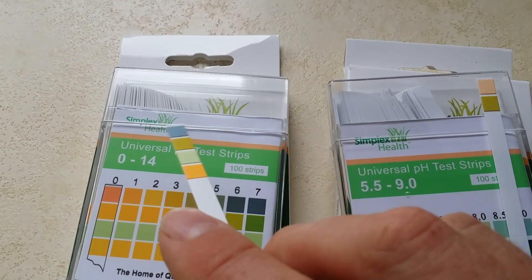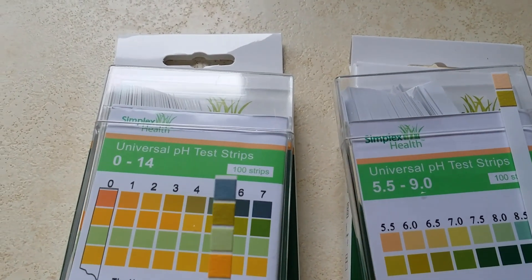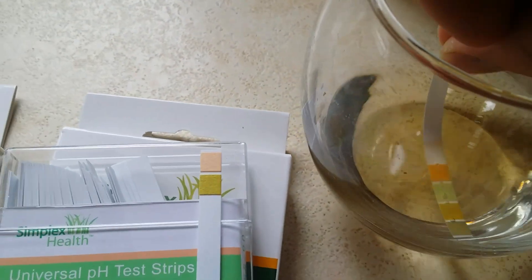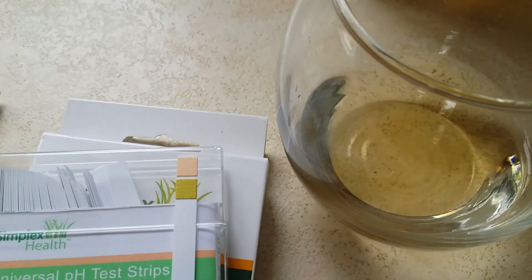So let's start with the 0-14s. We've got a pad here — it's a four pad test. You dip them in just for half a second and take it out.